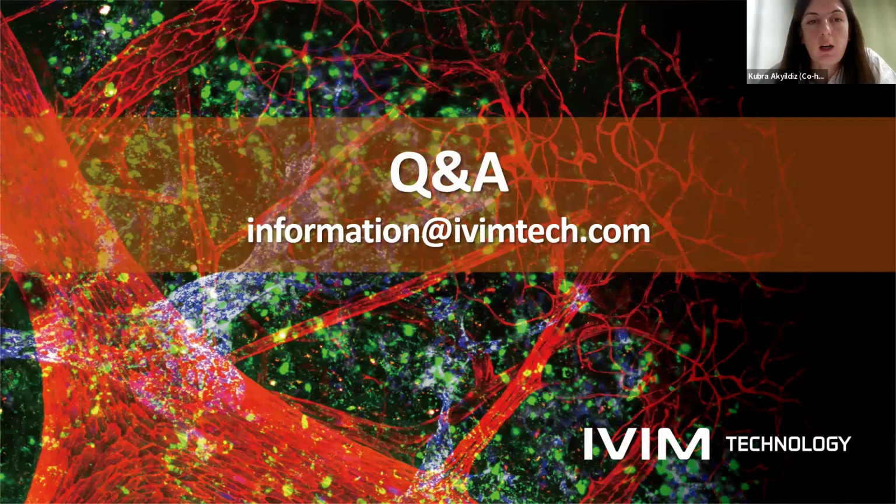Thank you, Jenny. There was another question. We already gave the answer through email, but if you want to answer it again, once the chamber is implanted on the mice, how long can it be kept there? So it would vary according to which organ you have implanted the chamber with.